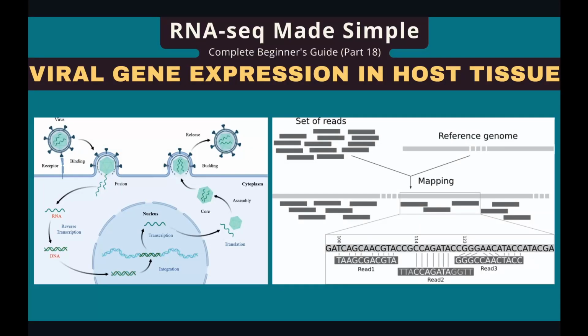In the last video, I showed you how to identify viral sequences in regular RNA sequence data. Basically, what we did was to map the reads to multiple viral genomes and count which genome captured the most reads. By doing so, we were able to detect which virus coexists with the host. Once we have this information, we can do some further analysis.